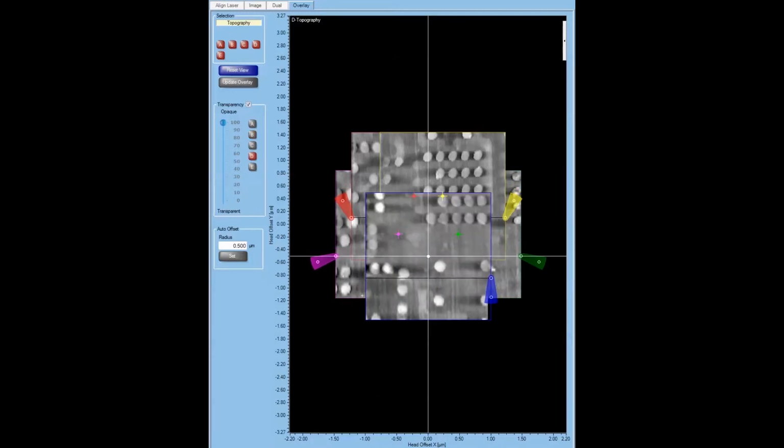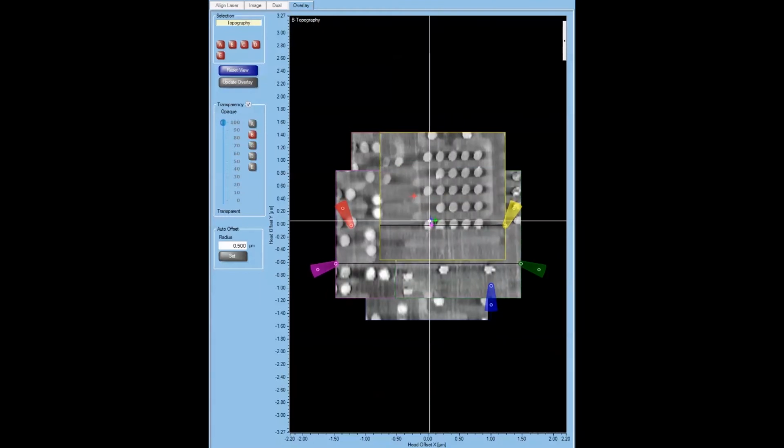The tips will drift as they get closer to thermal equilibrium. Wait for the tips to scan over the overlay point again and place the cursors over the new location of the overlay point. Engage the tips and click Scan. Place the cursors over the same device or memory cell you want to probe. Click Update Overlay and set the offset radius again. The overlay is now complete.